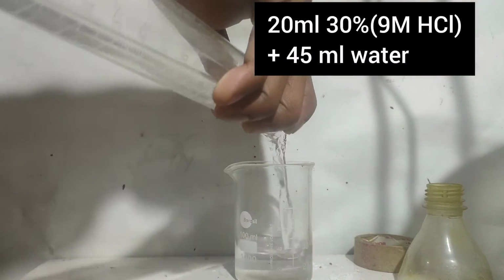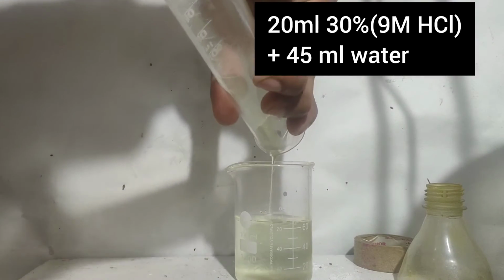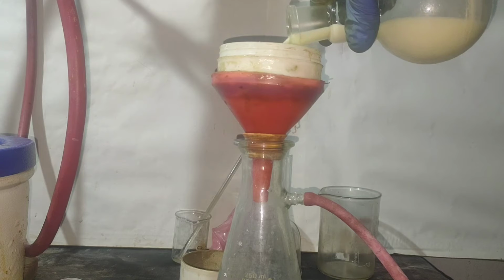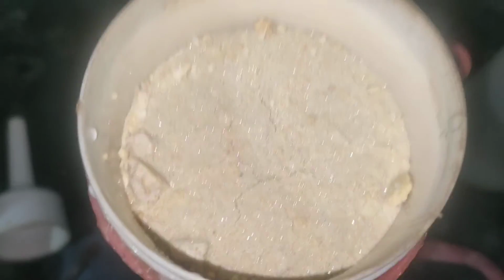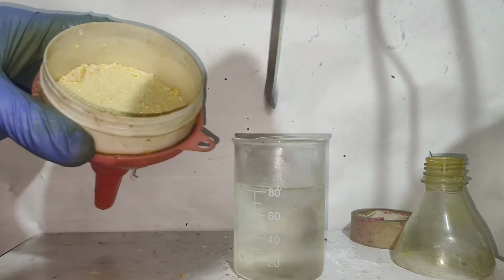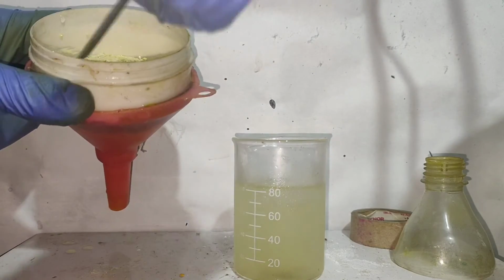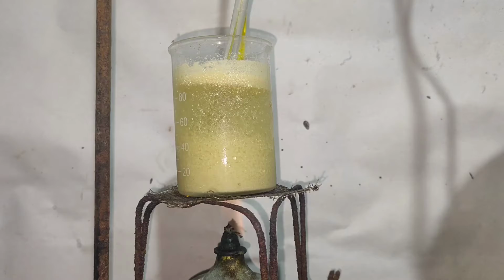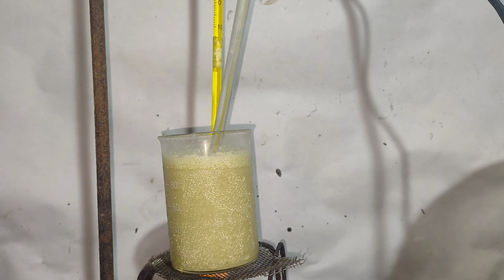For that, I took 45 ml of distilled water and to it I added 20 ml of 9 molar 30% hydrochloric acid. I then filtered the precipitate after cooling the reaction mixture with vacuum filtration and washed the PPT with distilled water 2 to 3 times. Then I added ice to the HCl solution to cool it and then I added the PPT to the HCl solution with stirring. When all the PPT was added, I heated the mixture to 60 degrees Celsius on a spirit lamp with stirring for 15 minutes.